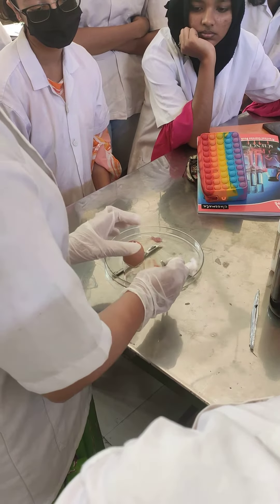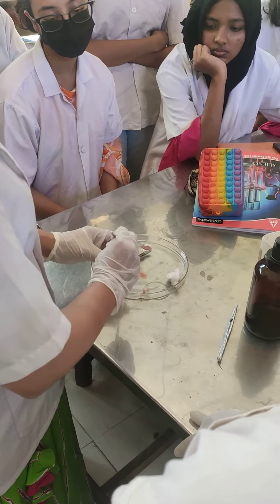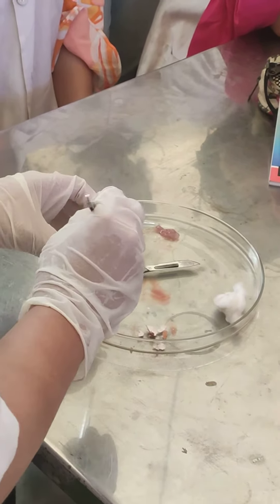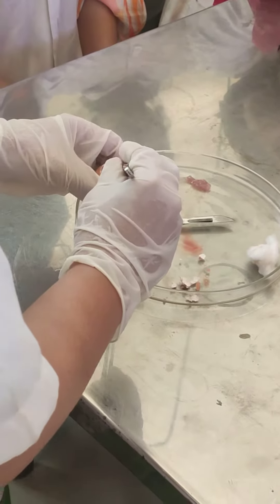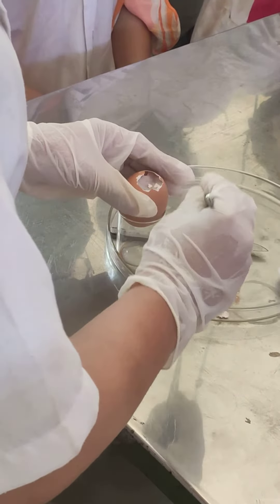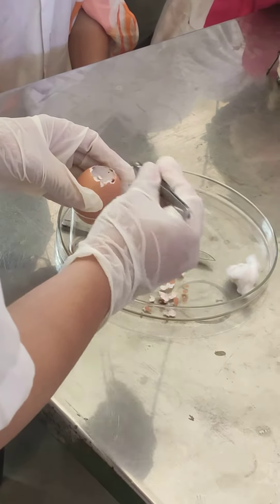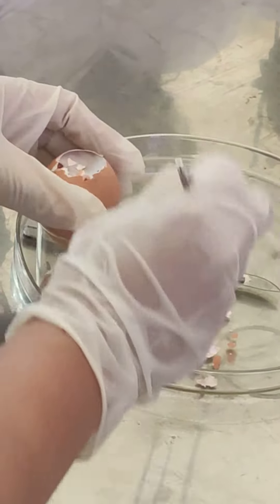It means to start opening this air cavity portion. This one is important with respect to exams, like all other experiments are also important with respect to exams. You also have to be confident that you have opened sufficient air cavity. By opening, you may make a hole in this membrane.